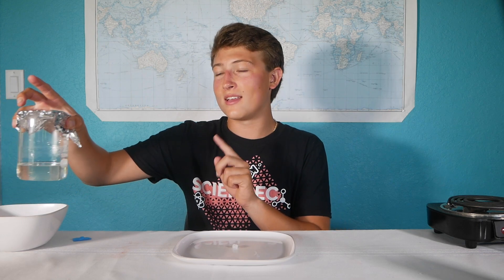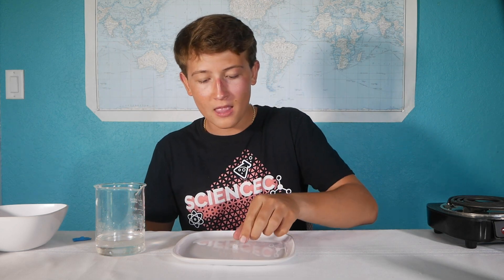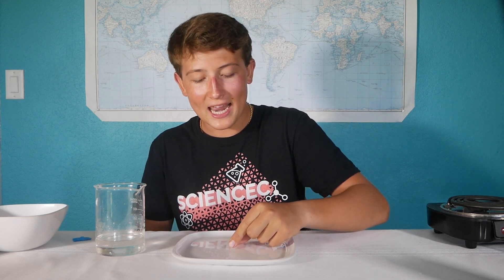Our sodium acetate solution has now cooled back to room temperature, which means that I am holding a super saturated solution. The only reason that this solution hasn't gone back to its crystal form is because the sodium acetate needs a nucleation site to form a crystal upon. So this little tiny piece of sodium acetate will be our seed crystal, and it will allow for our crystal to form.